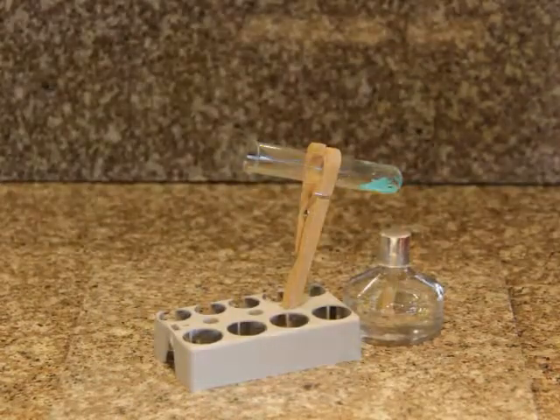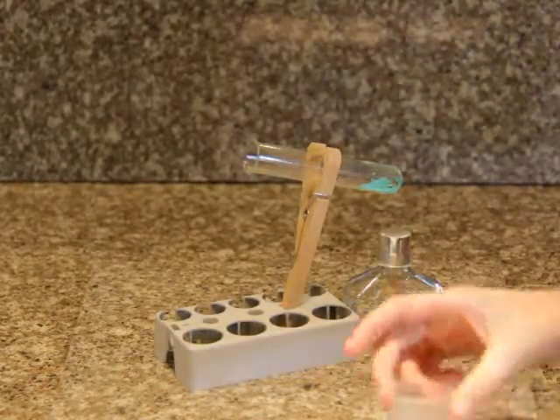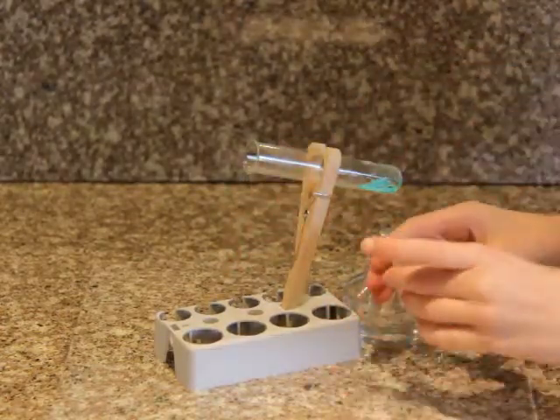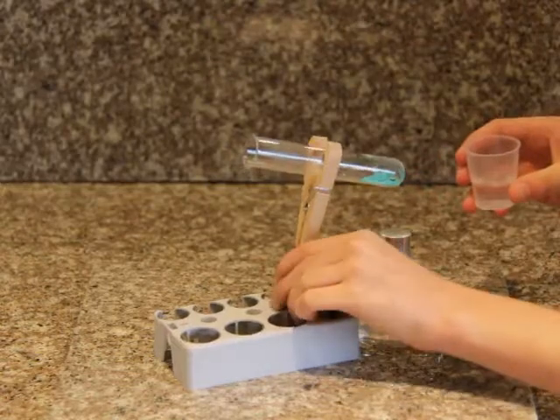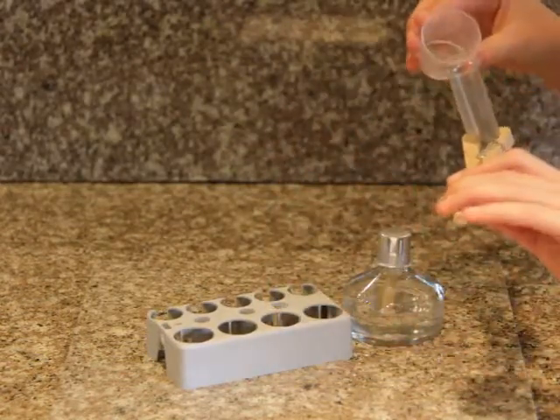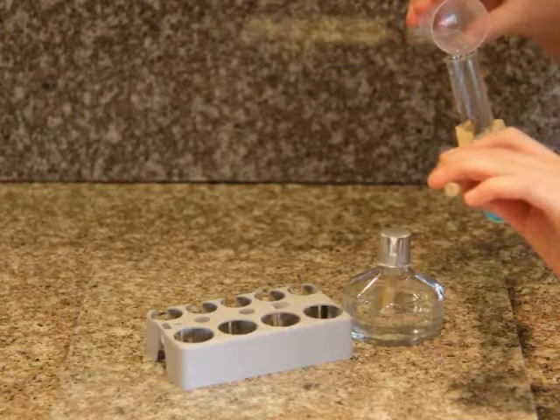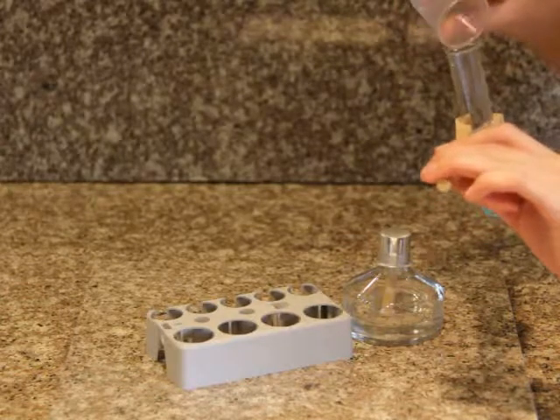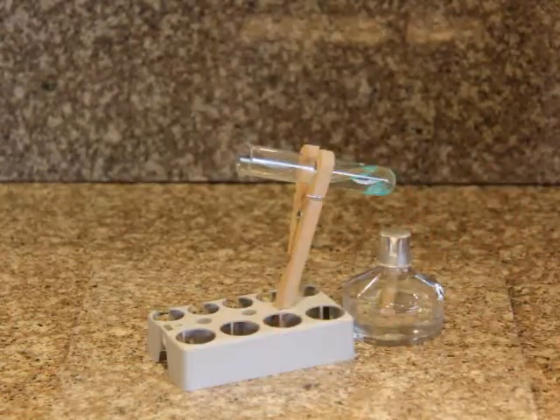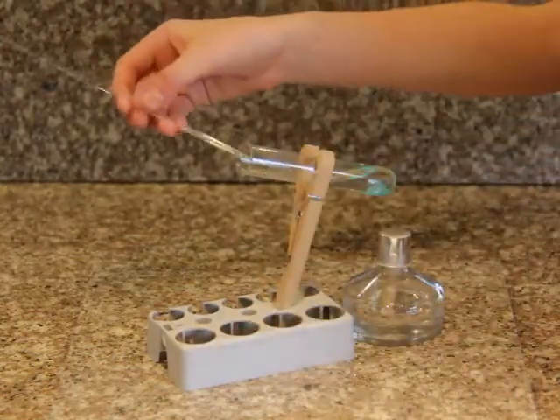Once the test tube has cooled, pour 10 milliliters of water into it, and then heat it over the alcohol burner using the boiling rod.